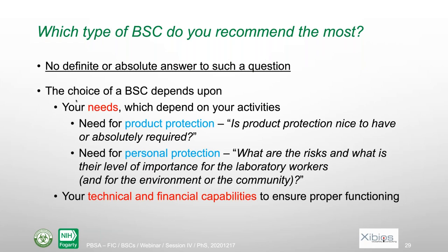The choice of a biosafety cabinet depends on your needs, which depends on your activities. And so your lab does not do the same thing as another lab. And so your activities are different and you might have different needs. And you need to look at two main aspects there, the need for product protection. Is product protection nice to have or absolutely required? And then, of course, for personal protection, what are the risks and what is the level of importance of those risks for the laboratory workers, but also the environment and the community?